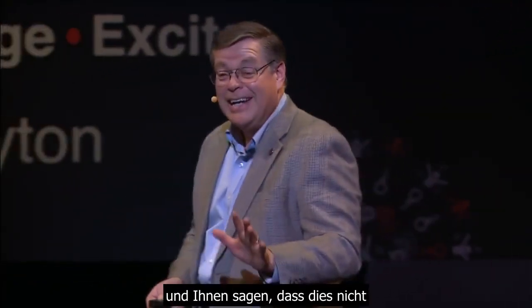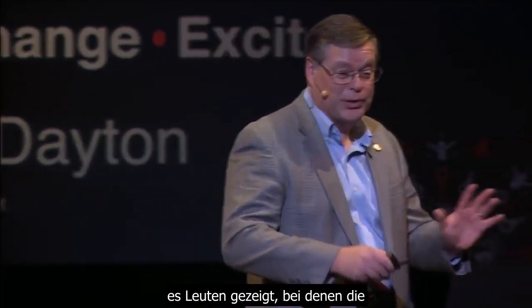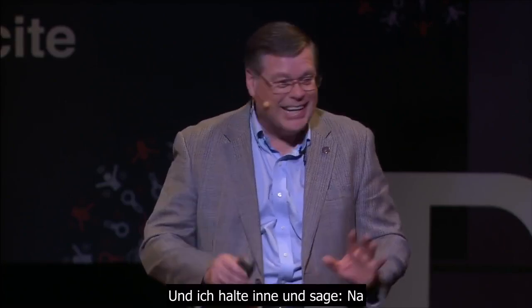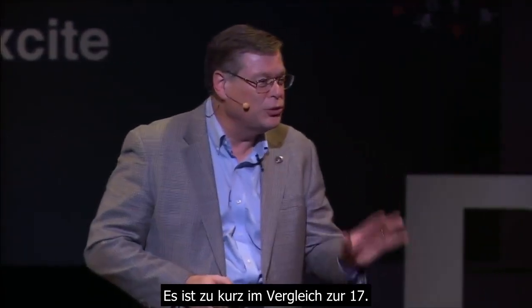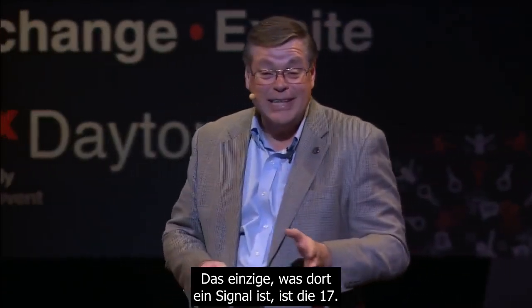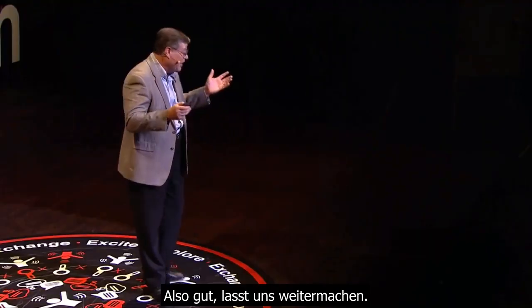Well, let me pause here and tell you this is not the first time I've shown people this particular graph. In the past, I've shown it to people where the crowd has been nothing but prosecutors and crime lab employees. And when I start to suggest that Bonnie should be excluded as a possible contributor because of that 12, they get fidgety. Right? And I stop and I say, well, have I said something wrong? And they'll give me feedback like, well, wait, that 12 isn't really signal. That's noise. It's too short compared to the 17. It's misshapen. It's kind of bumpy, right? That's not signal. That's noise. The only thing that's signal there is the 17. So you can't exclude Bonnie because of that 12. That's not really signal. All right, let's move along.